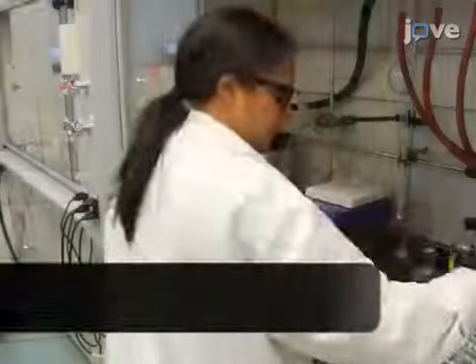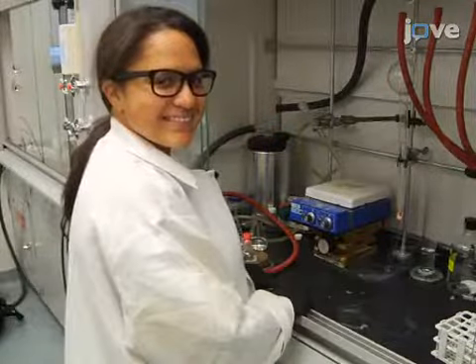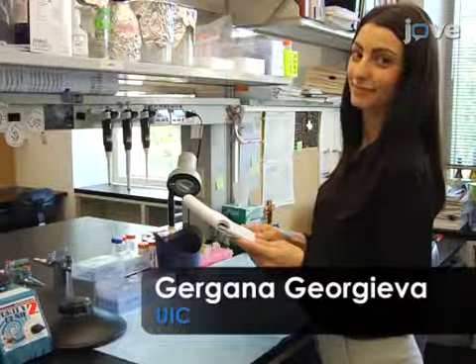prodrug. Demonstrating the synthesis of the aspirin-fumarate prodrug, GTC-PFE, will be Loruhama Delgado-Rivera, a graduate student in Dr. Gregory Thatcher's laboratory, whereas the anti-NFκB activity of GTC-PFE in breast cancer cells will be demonstrated by Gergana Georgieva, a pharmacy student researcher in Dr. Jonna Fraser's laboratory.